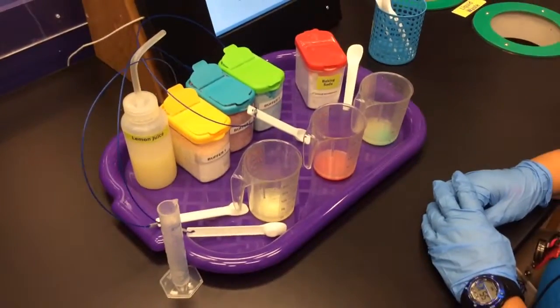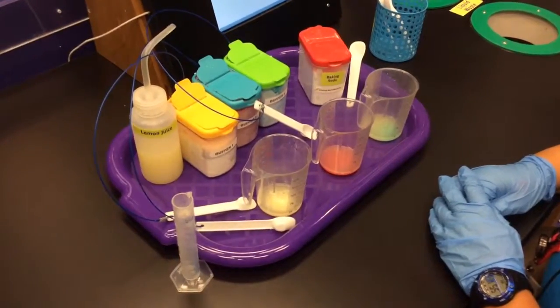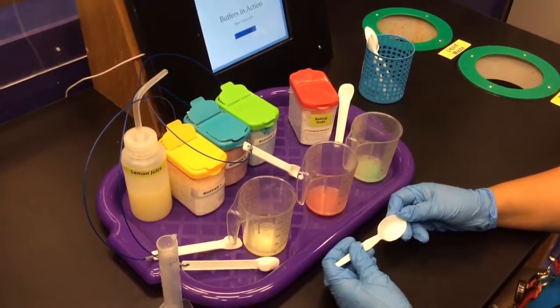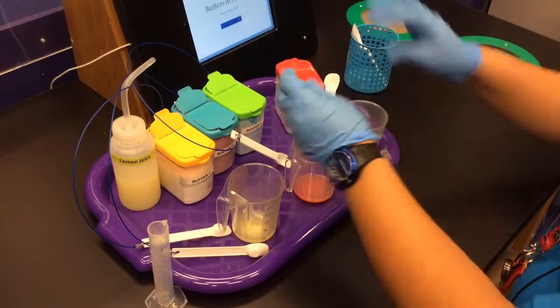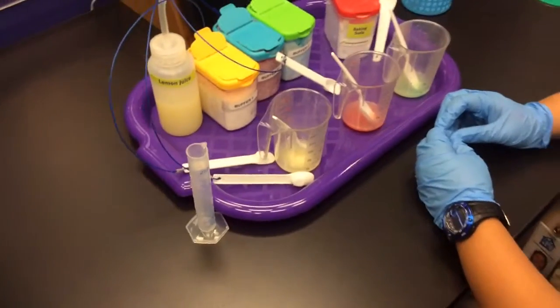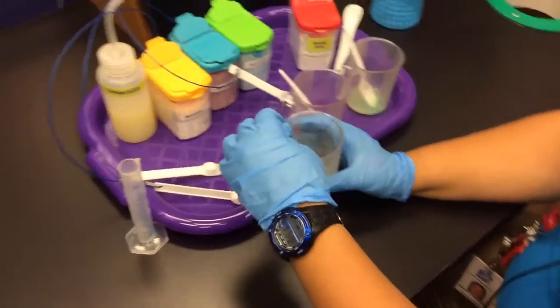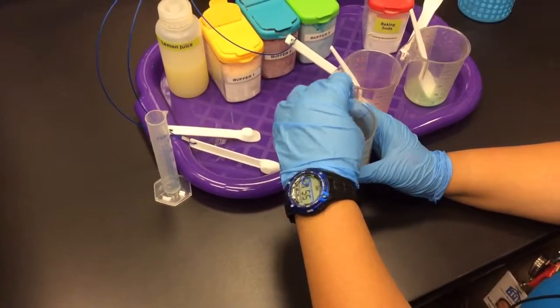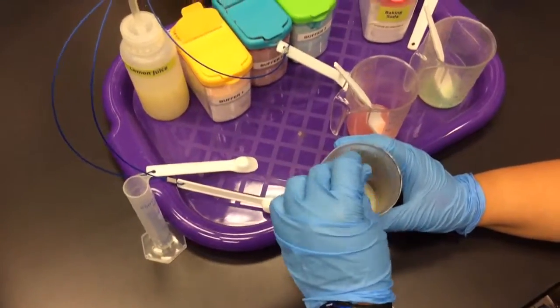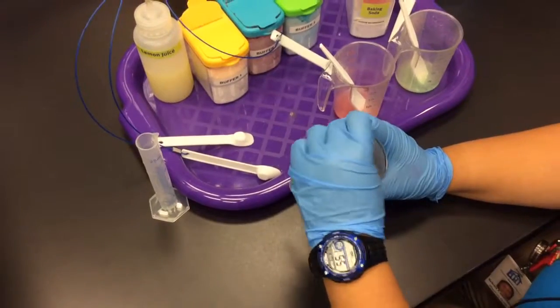So the next thing we need to do is break up those molecules inside of our sample. We're going to grab a spoon and place a spoon into each beaker, so we're keeping everything consistent. We're going to start off with our first sample and stir it for about 10 seconds, making sure that we break up a lot of those clumps and try to get it to dissolve as best as we can.